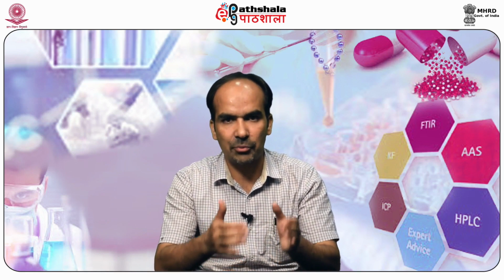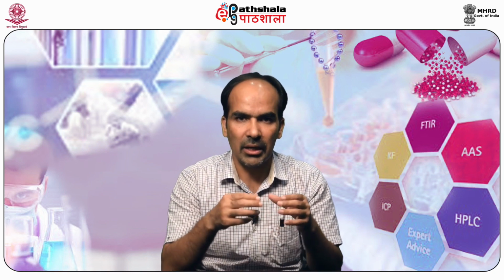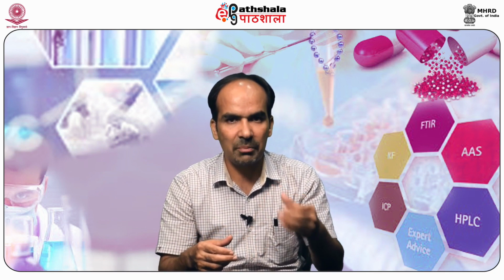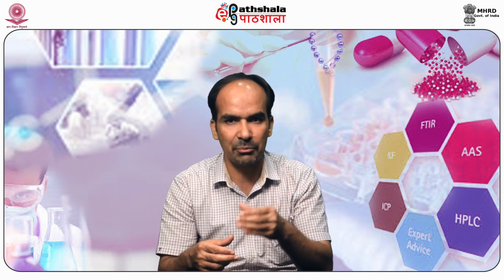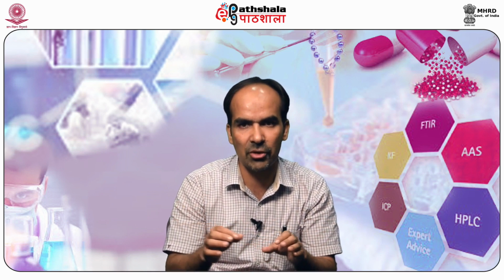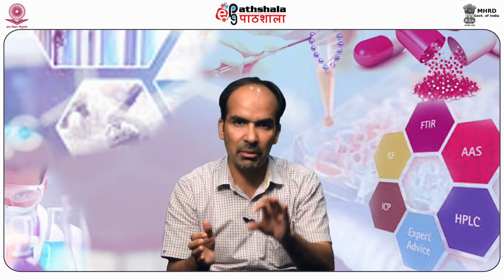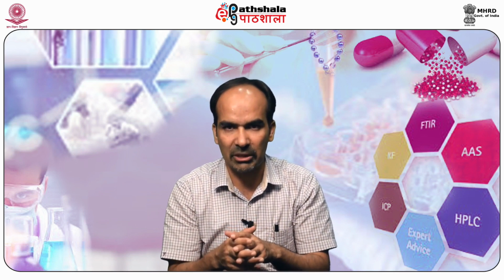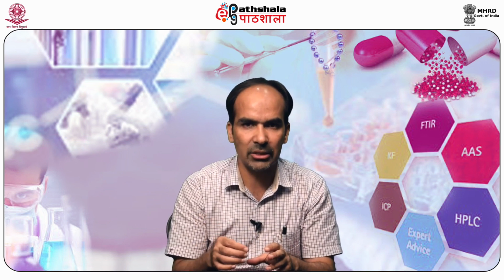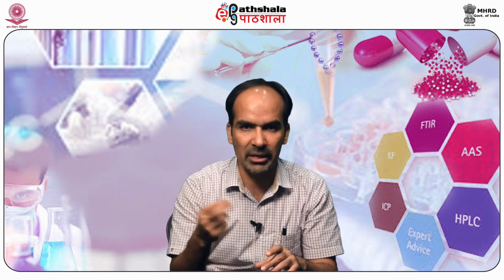As we understand, spectroscopy is at the center of spectroscopic analysis. It is based on the interaction of natural products or any substance with parts of the electromagnetic spectrum. We understand that the electromagnetic spectrum extends from cosmic rays to radio waves. The study of interaction of natural products with parts of the spectrum is the basis of spectroscopic analysis. It is also synonymously known as spectrophotometric analysis or spectrophotometric evaluation.